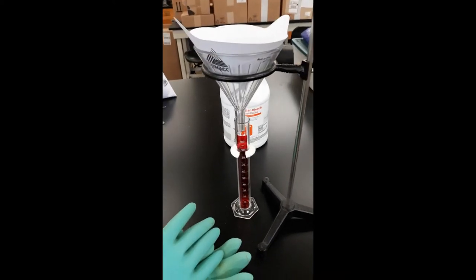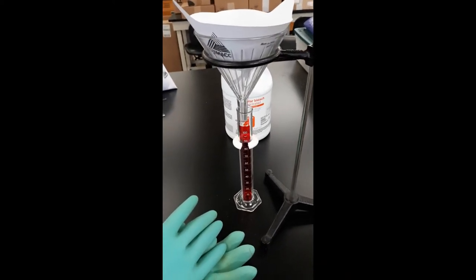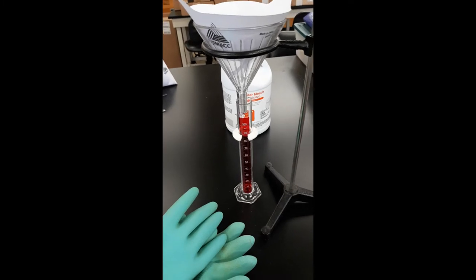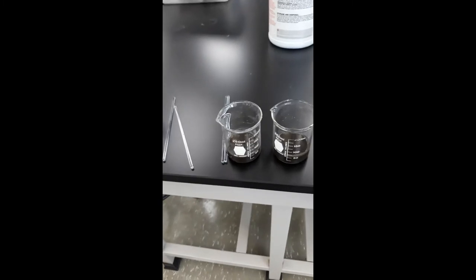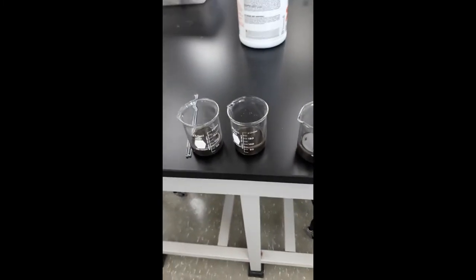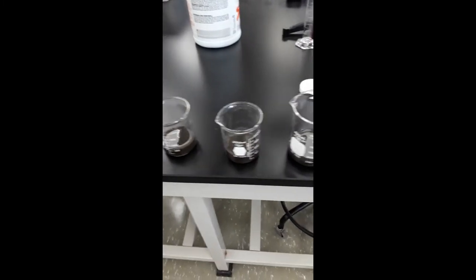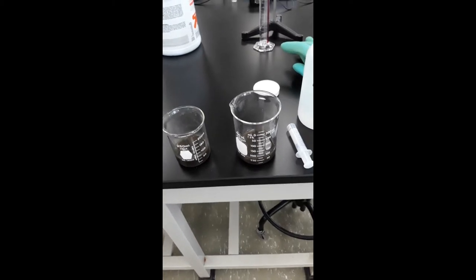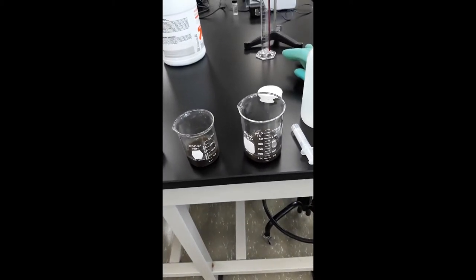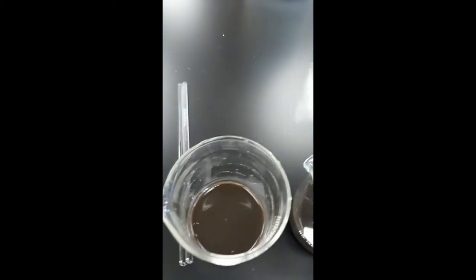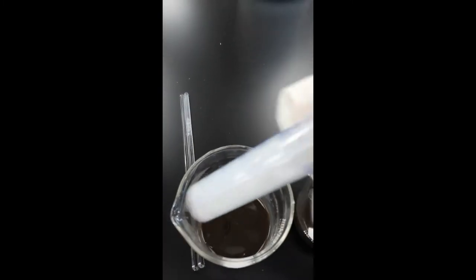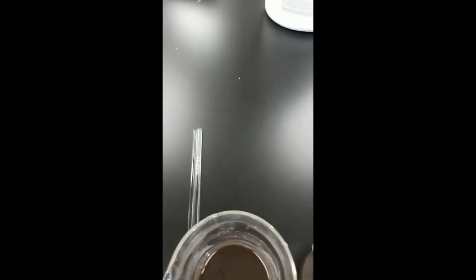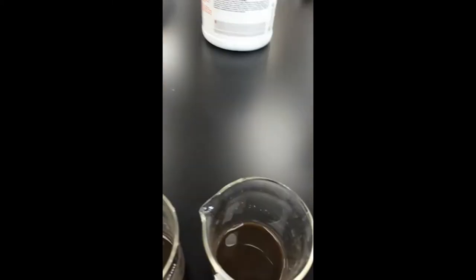We're going to add one mil to the first, five mils to the second, 10 mils to the third, and 15 mils to the fourth. So we're adding one mil here of the polymer and then we're going to stir that up.